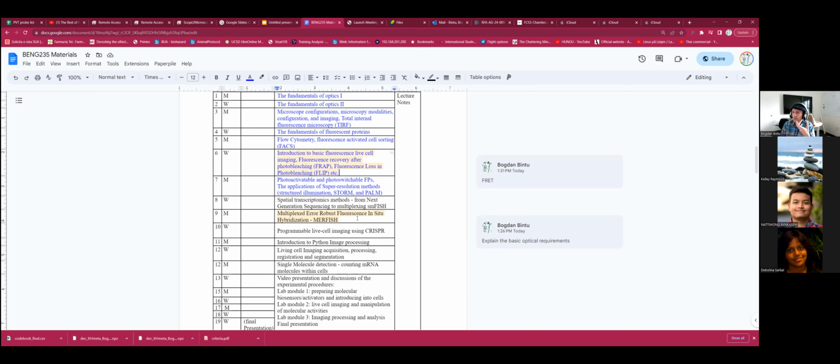Now, if it's a fixed cell, the way people have been imaging is you take your cell and you fix it, right? So you add formaldehyde to it and it's fixed. And then, rather than imaging with fluorescent colors, you connect it to a fluidics device and you flow and stain different things across different rounds. You can do up to 1,000 colors or so of, for example, different species of RNA. You can measure within a cell up to 1,000 types of mRNA molecules, or even more, and then know exactly where they are in the cells and what they're interacting with. For example, they might be interacting with a particular type of protein, which you also co-label.